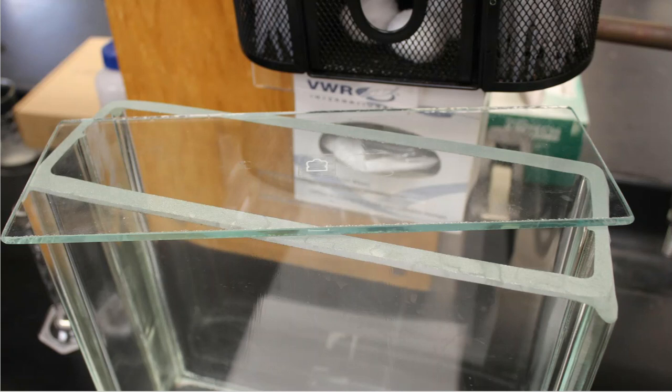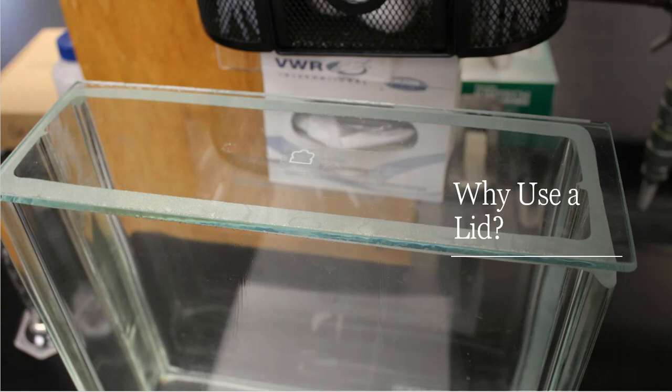So you only need to put in enough mobile phase in the bottom of that chamber so that way these plates can sit in it and start sucking up that liquid over a course of time. Each chamber will have its lid, and this is what the lid looks like. Of course, that lid is there to prevent evaporation. We don't want our solvents to change composition over time, so we can put a lid on it. And when we do put a lid on it, it will trap everything inside of that chamber, and it can help ensure that my composition is not changing over time.